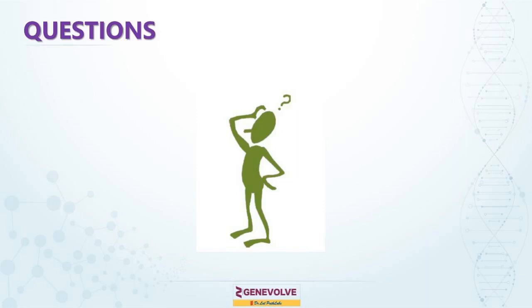AmpliSeq's advantages really are in the fast turnaround time. I think we just need to be clear that AmpliSeq is the library panel technology that's run on the S5 system. So those two together give you the whole fast turnaround workflow. Because AmpliSeq is also available for Illumina, but you don't get the benefits of the fast workflow because, like Dr. Atul said, on those NovaSeq systems, you still have to wait to batch your samples for it to be cost effective.